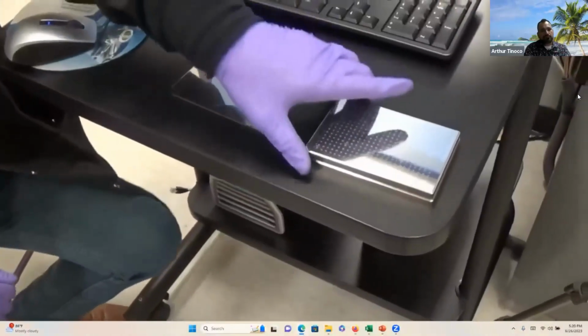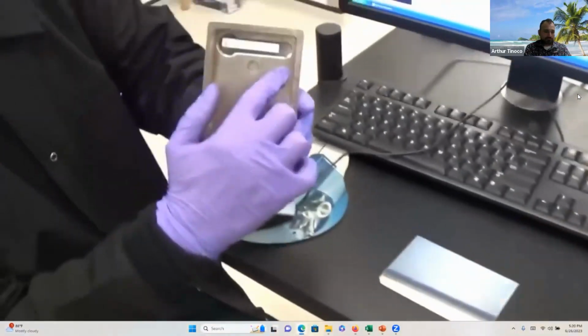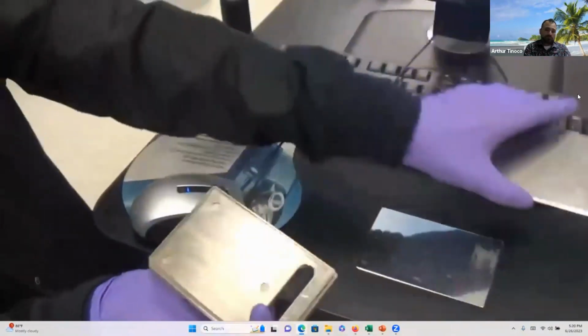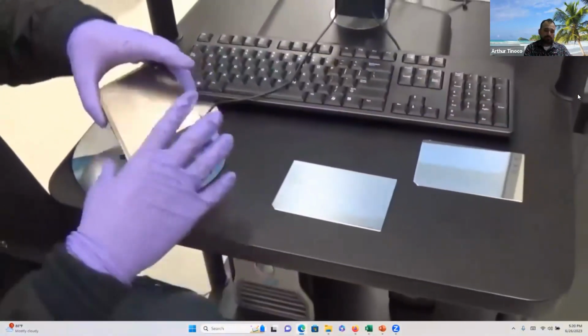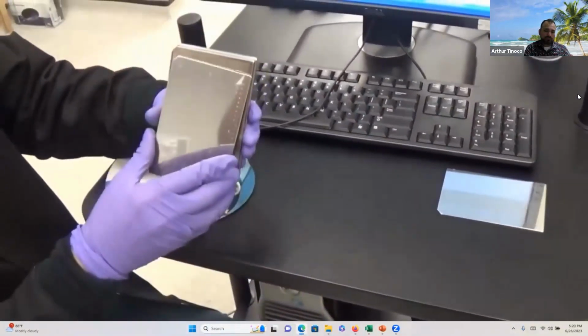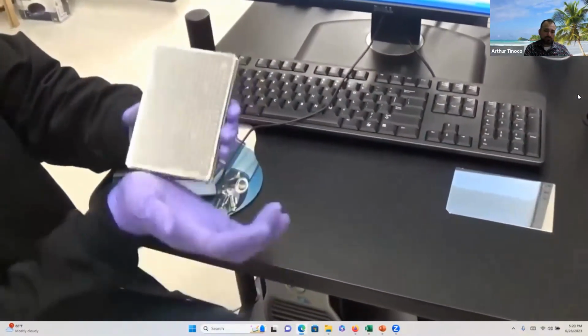We will remove the calibration plate from the insert. Behind, you will see a space that you can use to push your finger and remove the plate.